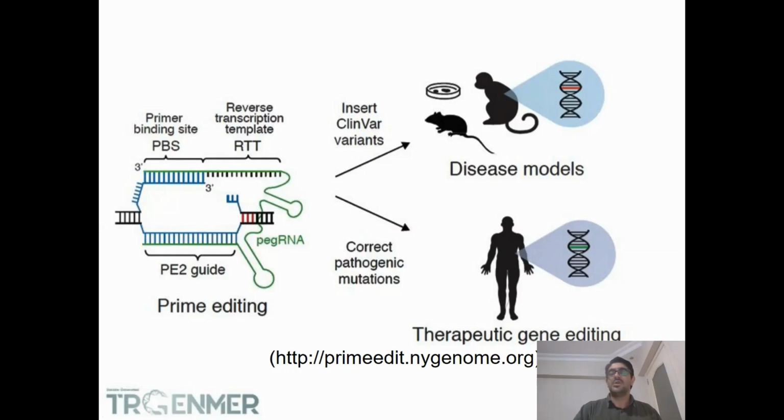On the other hand, if you want to focus on repairing any mutations in the human genome, then you can select the pegRNA on that database with the help of therapeutic gene editing. And in both cases, the database produces the pegRNA with the spacer sequence to the specific site of the variation, and then PBS and RTT sequences at the same time to change to your targeted variations.